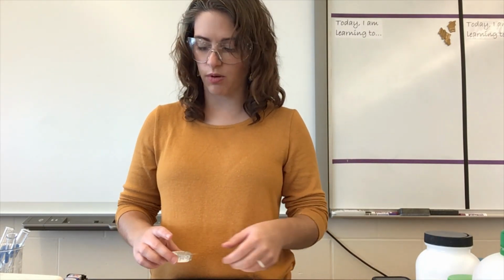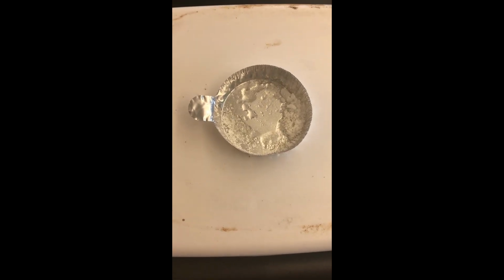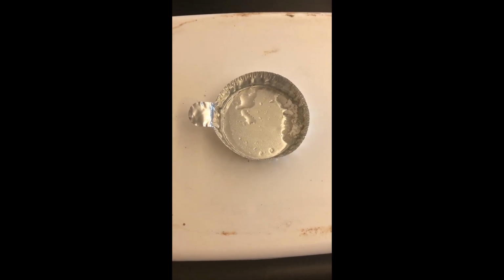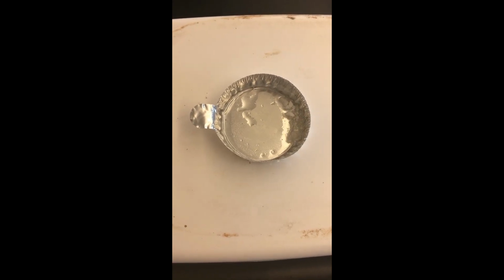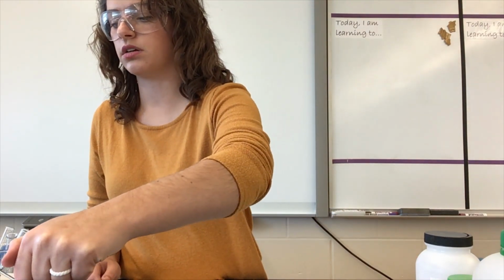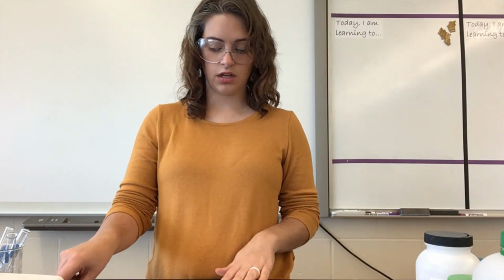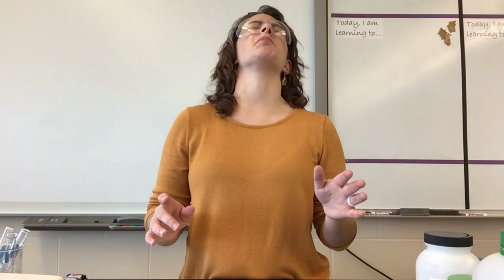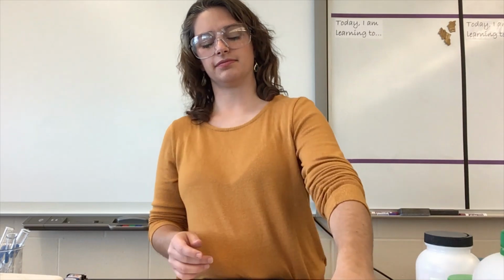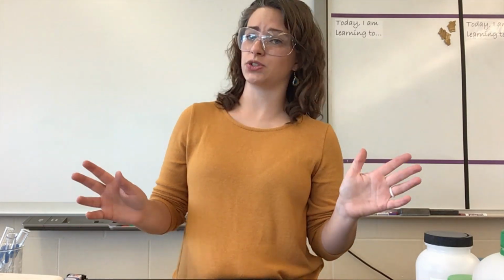Okay, last one, melting point. So that one melted almost instantaneously. So that is definitely a low melting point. So let's go back. Oh man, it smells so bad. Oh God, that's bad. Oh, the joys of chemistry.